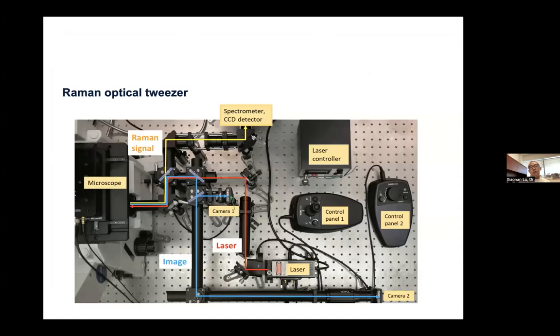So this is a recent example that is an ongoing study in my lab at McGill right now. We built this homemade Raman optical tweezer. So what is an optical tweezer using Raman spectroscopy? For conventional Raman spectroscopy, you can only collect the spectra on the basis of the biological or chemical samples you put onto a substrate. However, it's very difficult to handle live bacteria or live microorganisms in an aqueous environment.